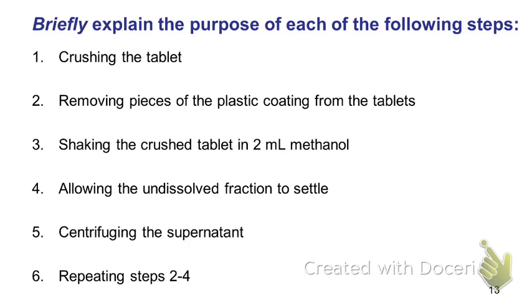We go through line by line and say, what was the goal of this step? Is it something important procedurally? Is it something important experimentally, theoretically? It's addressing each of those individual issues. So this works for you as far as studying for your quizzes, because in theory you should do this with all of your labs. We're forcing you to do it on this one as kind of a simpler one, so you get a better feel for what's happening and what you did with the previous labs. So the intent is to go through, label each of these with what the ultimate goal was.